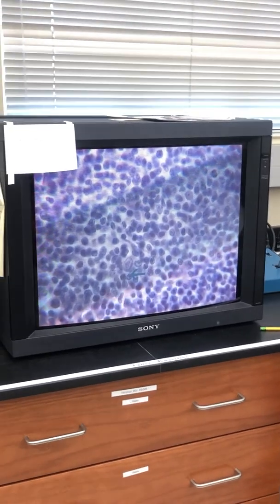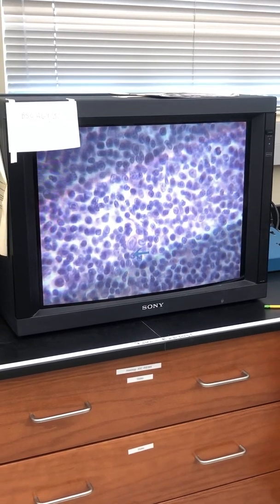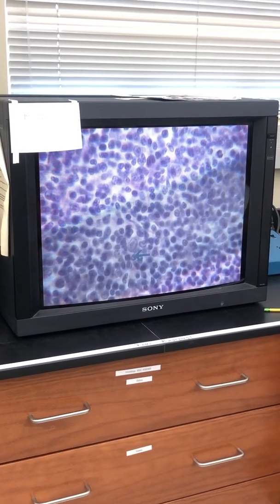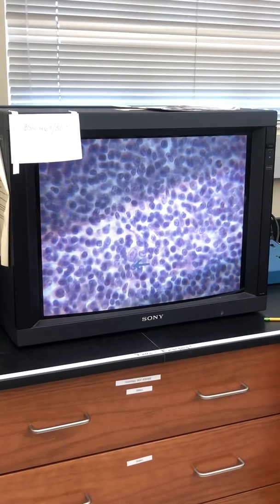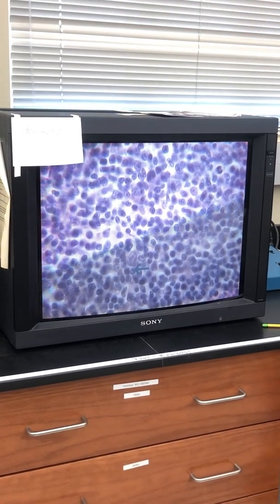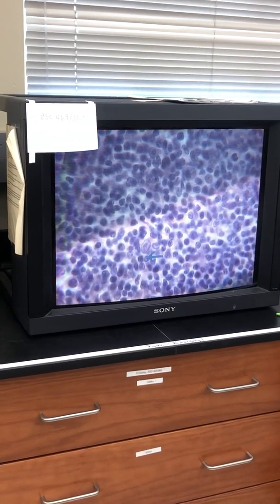Or some of the cells may be macrophages that are coming out to try to recognize or eat up something in this area. But it's a way to let cells get out of the vascular system, because normally the spaces aren't very big, and so having it constructed this way will allow bigger cells to get out of the system and then stay in the lymph node. Does that make sense to y'all?